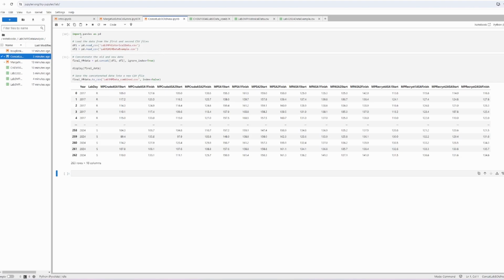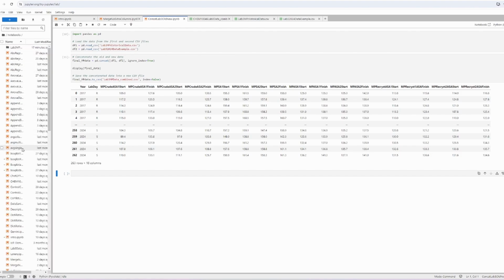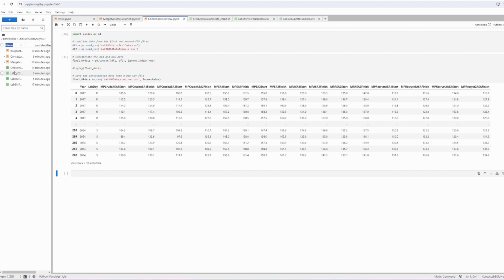So here we're going to import pandas as pd. For df1, we're going to import the first file. What I've done is I've put the file into a new lab notebook. Under notebooks here, mine was starting to get really busy, so I'll let you take a look. And so what I did was I made a new file folder here. As long as all the information is within the same file folder, you're going to find that it goes pretty flawlessly, which is quite nice.